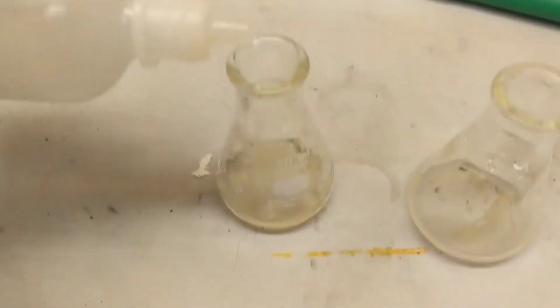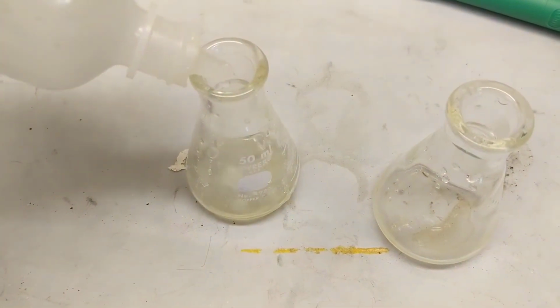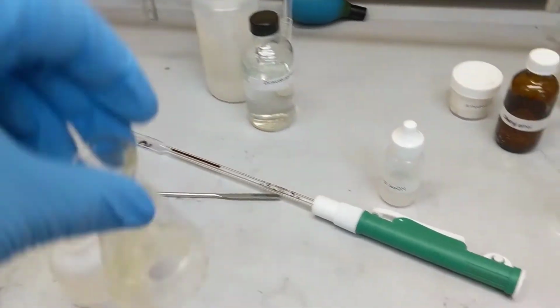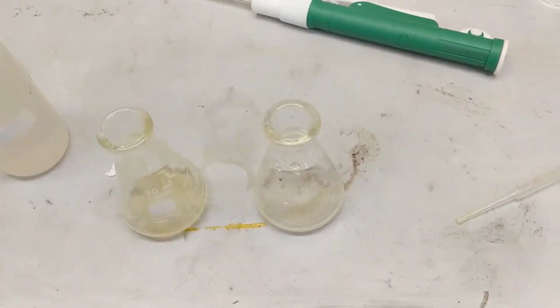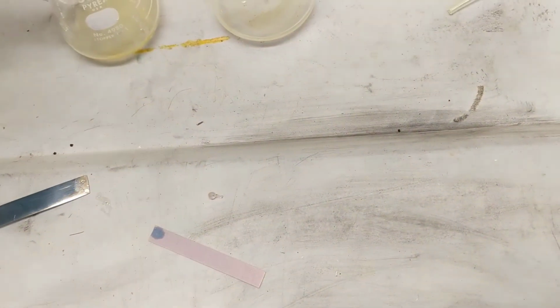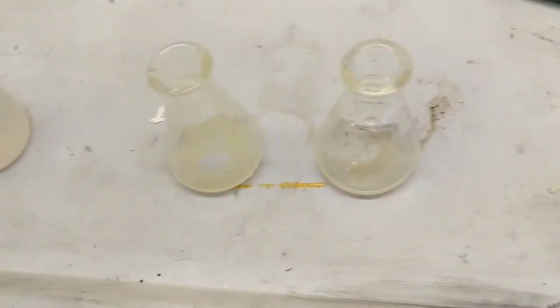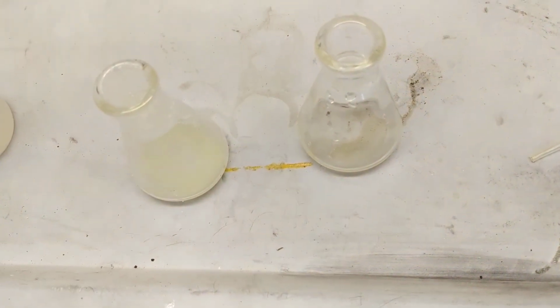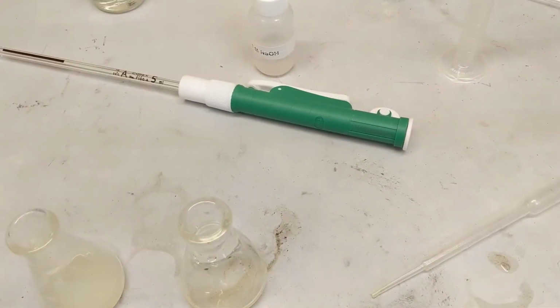So, to the first one. I added it, and you can see it's gotten pretty cloudy. Let's check and see if it's acidic. I'm just going to take a few drops, put it on this blue litmus paper. Nope, it's still very basic. So, add a little more. You can see it's a little cloudier. I'm going to add about 1 more milliliter.